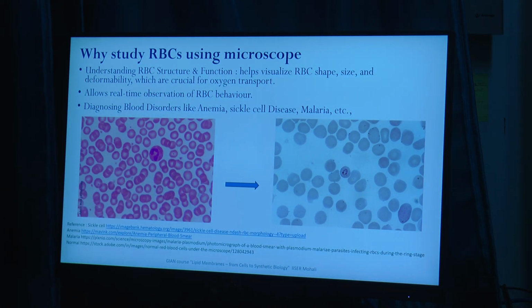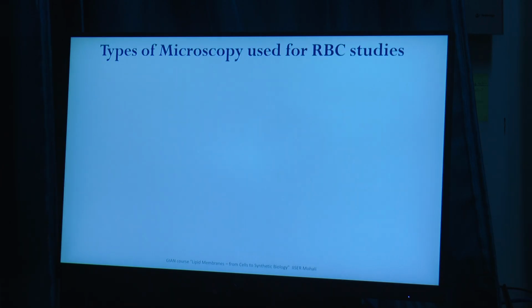So just by observing the red blood cell under a microscope, even minute observations can give a huge interpretation of how the morphology, structure and functionality are changing due to interaction with different pathological, chemical, environmental and physical conditions, like we spoke about stretching and bending through tweezers, AFM and all that. Depending on the force responses and how they are observed under a microscope, a lot of significant outputs and insights can be extracted about the red blood cell.